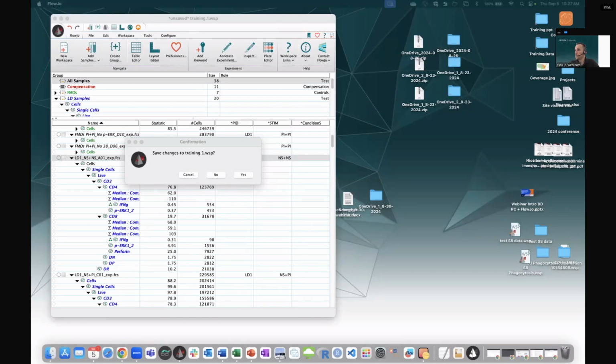Any other questions? We're way above the hour normally allocated for this training, but happy to keep going. I have an issue with slowness during the analysis. What is the best configuration for FlowJo? Best configuration. So FlowJo recommended, I think the minimum recommended is i7, 8 gigabytes of RAM. I think that's now the minimum recommended for FlowJo.